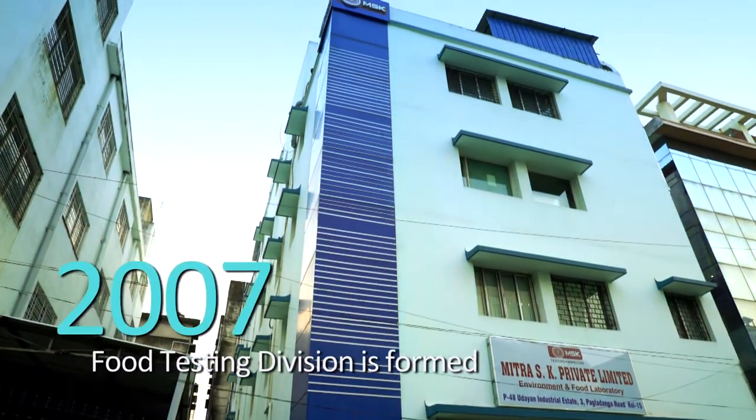Mitra SK has specialised skills to serve all major sectors and, in 2007, opened its food testing division.